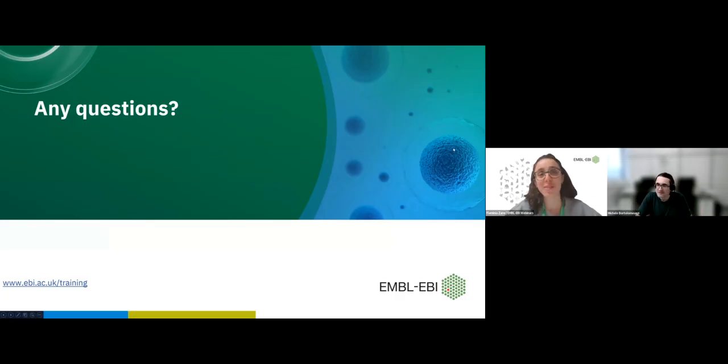Thank you so much, Michele, for your presentation and for all the demos as well. We are around the end of time for the webinar, but if it's okay, can you stay a few minutes more so we can take some questions that we have in the Q&A, or do you have another commitment? No, all good, and sorry for going a bit long. No problem. It was very interesting, and I think it was important to have both slides and a demo to understand better how the software was working.